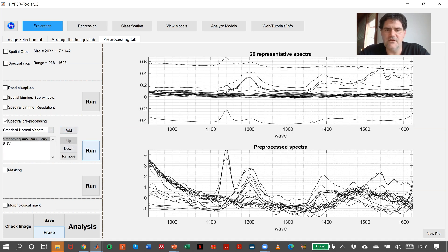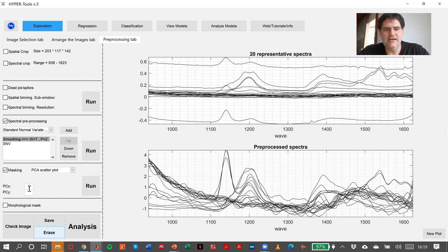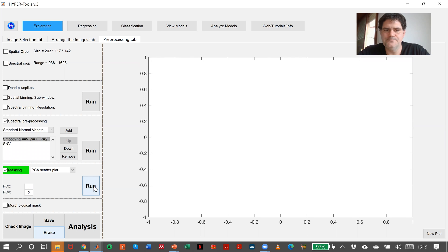And now I will do masking PCA Scatterplot, PC1, PC2, and run.